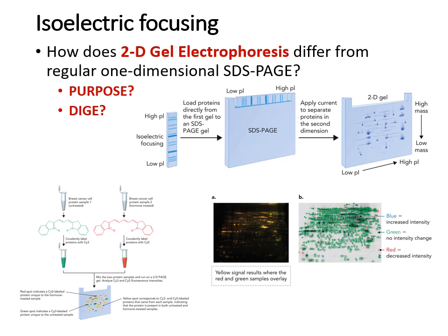Now, there are different versions of gel electrophoresis. It could get a bit fancier and try to give you more information. The ones that we were looking at a moment ago are called one-dimensional SDS-PAGE, and those are the ones that separate the proteins on the basis of their different sizes, and they're able to run across that gel based on the charge.